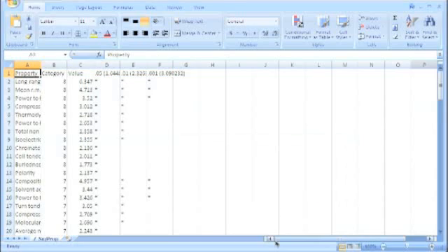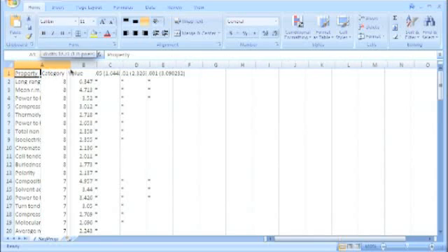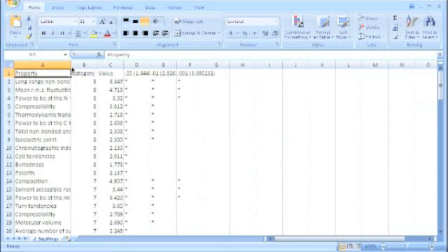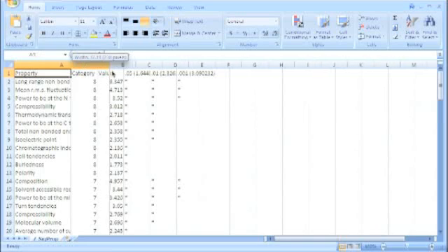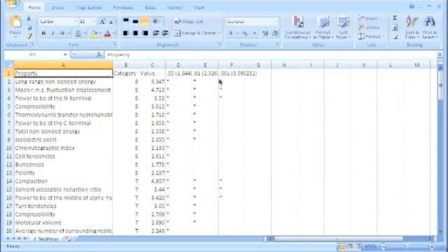So, now that we have that, we have a list of the most probable, most changing amino acid property. And this is the long range non-bonded energy. Which sounds pretty exciting, huh? So, if we're looking specifically for the ones that have asterisks in all three columns, meaning they are significant at all of these levels. Of course, if they're significant at the one thousandth level, they're going to be significant at the others. So we're going to move down, so the category eights, there are these three right here.